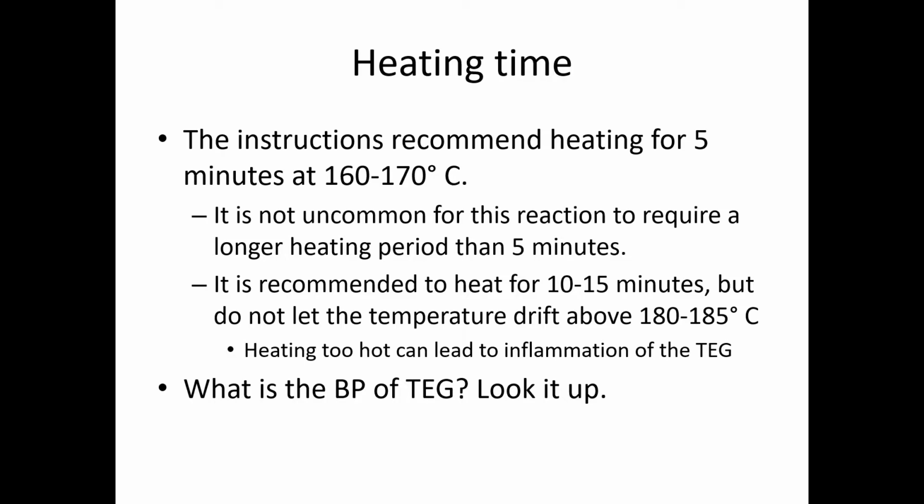So we recommend heating the reaction for 5 minutes at 160. It's not uncommon for the reaction to require a little bit more time than 5 minutes. So usually we recommend that when you heat up the reaction, you should heat it up for about 10 to 15, but do not let the temperature drift above 180 to 185 degrees Celsius. And this is because when the flask gets too hot, this can lead to inflammation of the triethylene glycol.